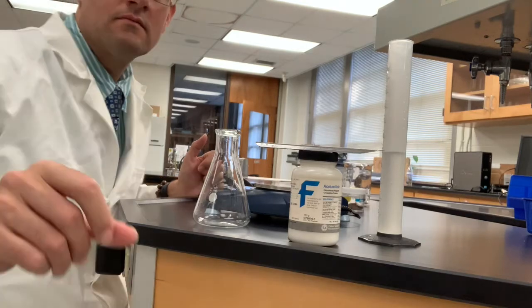Determine the melting point of the crude acetanilide as well. These physical characteristics can be done in parallel at the same time. All right, let's do it.